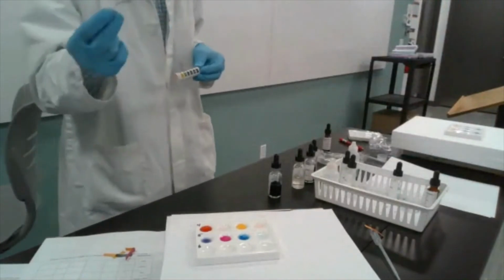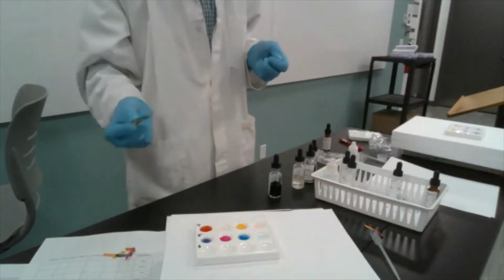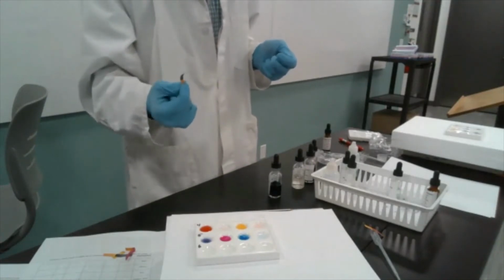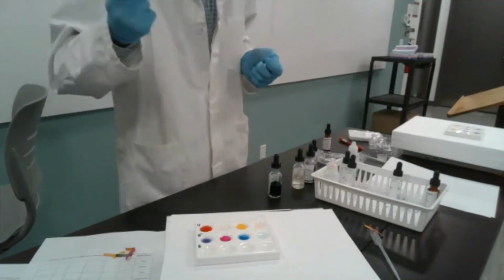So again, if you're familiar with the pH scale, this should tell you right away for your conclusion what the chemical nature of the substance is, whether it's a base or whether it's an acid.